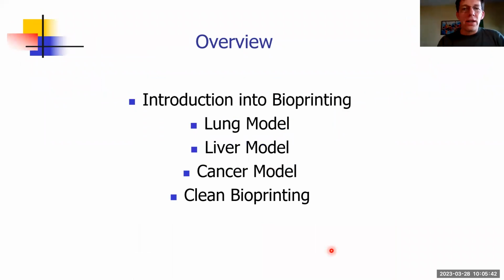So what I want to go through is I will give you a brief general introduction into bioprinting technologies, and will then more specifically focus on our research. As Katrin already introduced, we do various organ models for infection studies, particularly lung models and liver models, and then we also have projects to produce cancer models. And I will have an extra section on xeno-free methods to do something we call clean bioprinting, which means to produce models for research without any animal components.